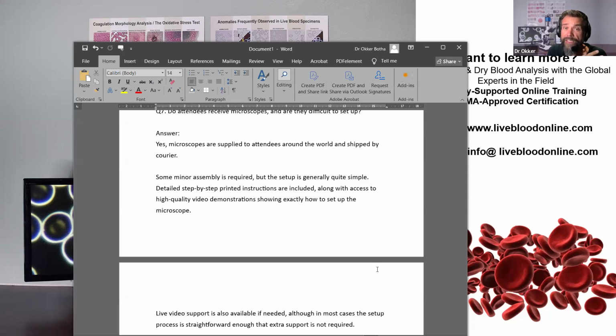You would need at least 100-watt halogen in terms of brightness, or the equivalent in LED, to produce the necessary level of brightness to create that high type of contrast image that we need to get in dark field. So it is a very, very important factor. Yes, absolutely.